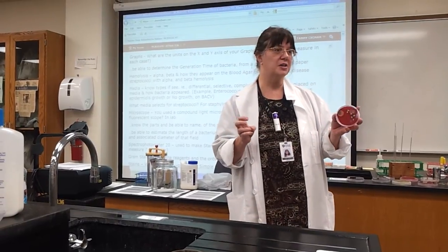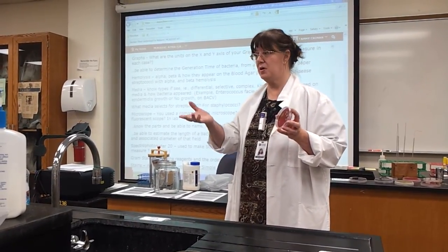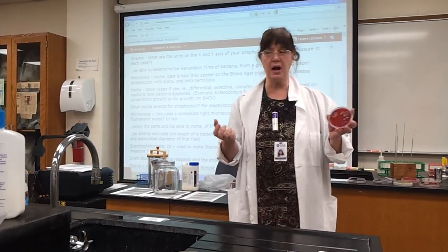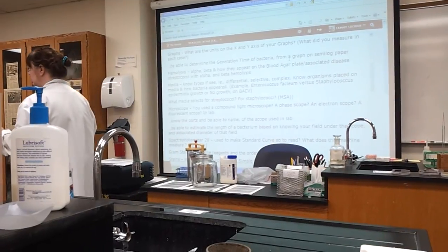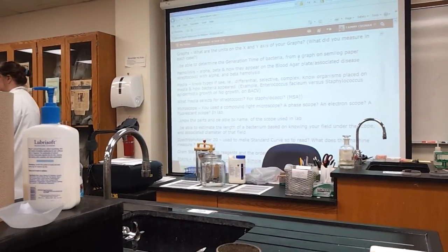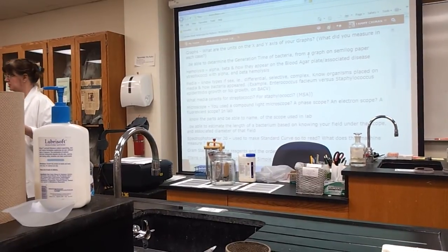Gamma streptococci. Do you worry about it? It means no hemolysis. They're not going to hurt you. Gamma means no hemolysis at all. They're just the flora, and they help you. Can y'all hear? Way back over there. There's a section up here.